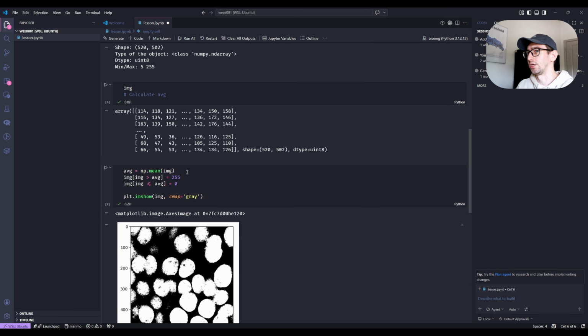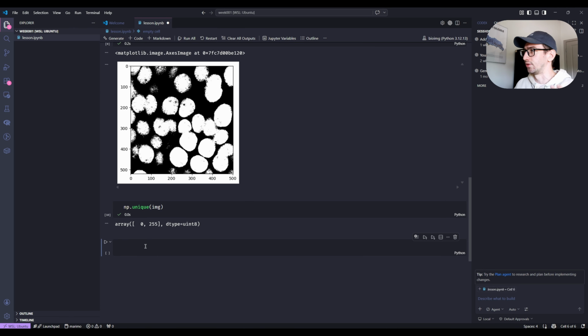But in this particular case, for example, right away, I already don't have access to the values that they were before. And in case I want to get the values again, I need to reread the image. And in the analysis, it's always a kind of balance. You usually think about the memory that you're using in your program. So for example, sometimes images could be very big, and in this case, you don't want to create new objects in memory and overflow your memory.